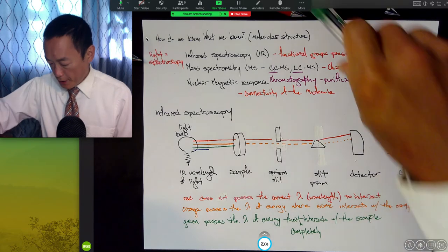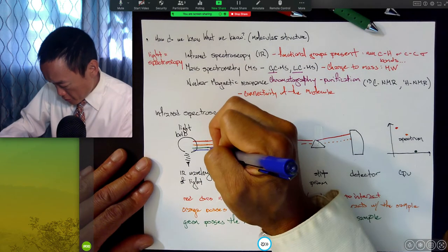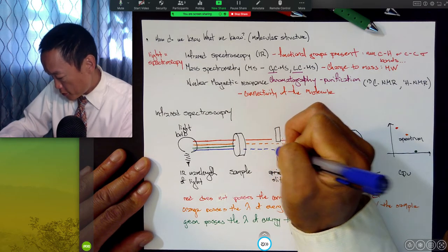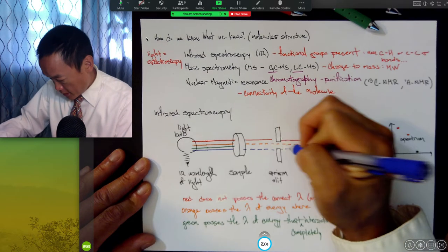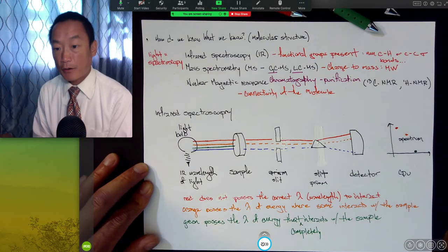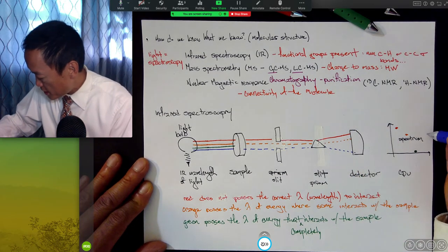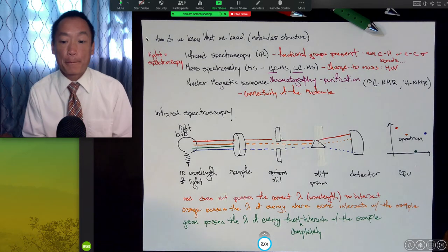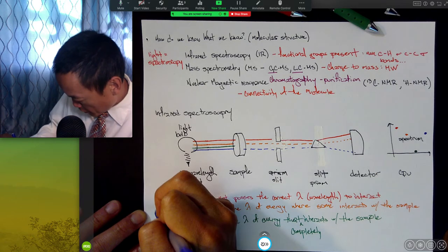Okay. And then what I'll follow through here with the blue is the same idea that happened with the orange, where that is going through the slit, it hits the prism, some of that energy was absorbed by the sample, and then all of a sudden you're going to see that appears somewhere else in our spectrum. So that's what's happening. So we'll say blue over here.